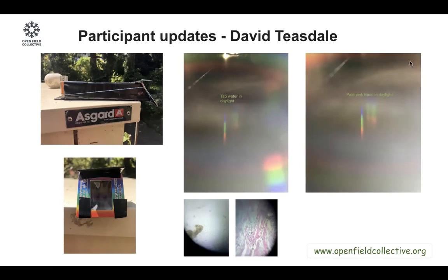The first time, yeah, you got that sharp line, and that indicates that the length of the device and everything is done nicely. You just have to find a way to connect your cell phone to the diffraction grating, like tape it there, like Foldscope, so that everything is close. That's what I thought. Yeah. What about the diffraction grating? Have I got it the right way up? Yeah, the diffraction grating is perfectly aligned, I think. Because that rectangle should fit into the rectangle of the device, right?